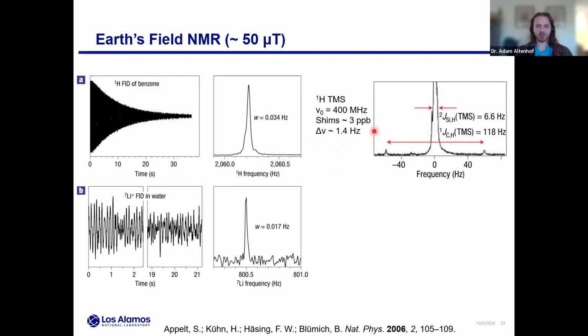So to show a very nice example from the same paper, this is the proton NMR of TMS, the well-known shift standard. They're on a 9.4 Tesla magnet, good shims. This main singlet line has a line width of about 1.4 hertz. And now looking down in the baseline, of course, we'll see carbon satellites, but we'll also see silicon satellites in TMS. In this case, the silicon J coupling is about 6.6 hertz, but you can see, even on this fancy system, we can't really resolve that coupling that well.